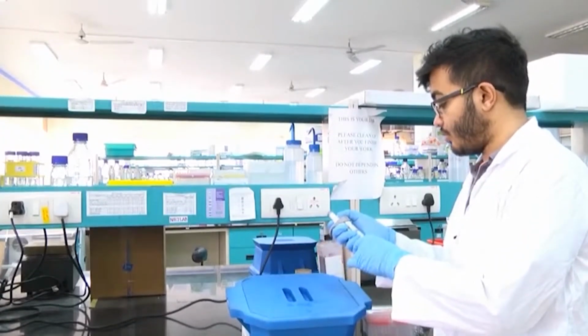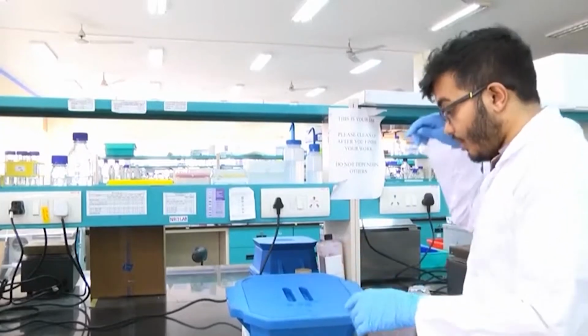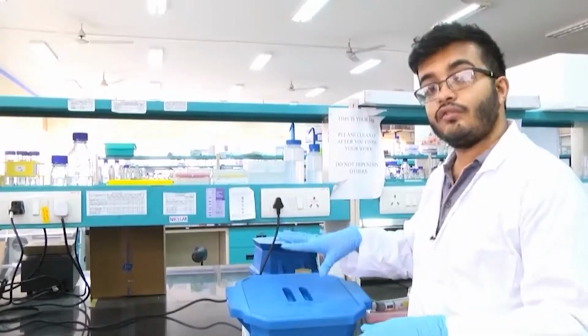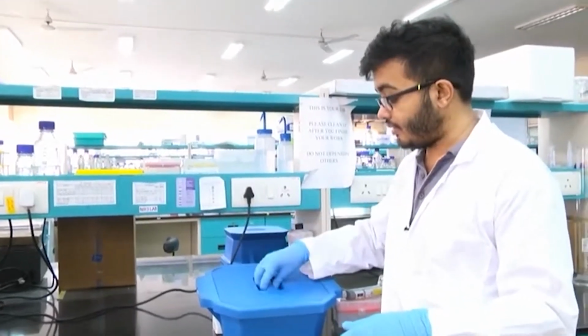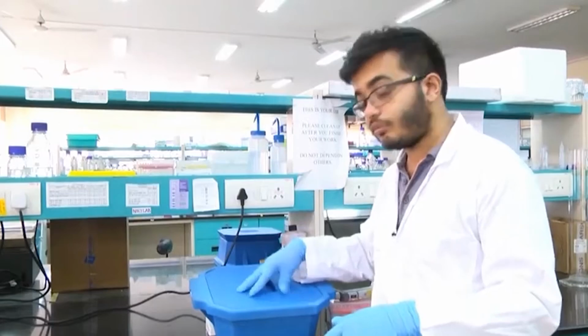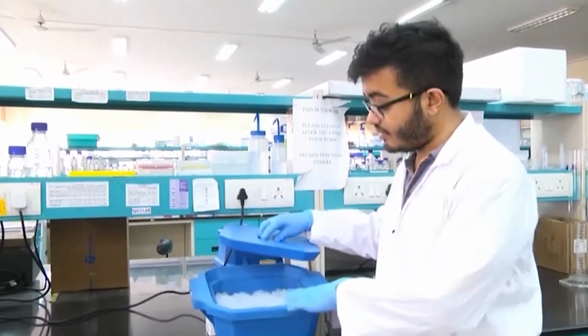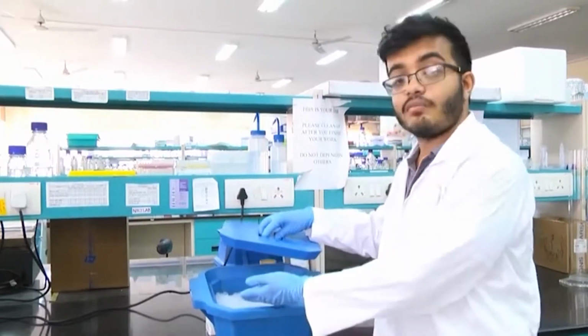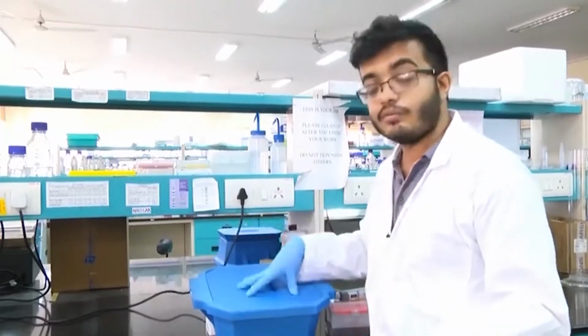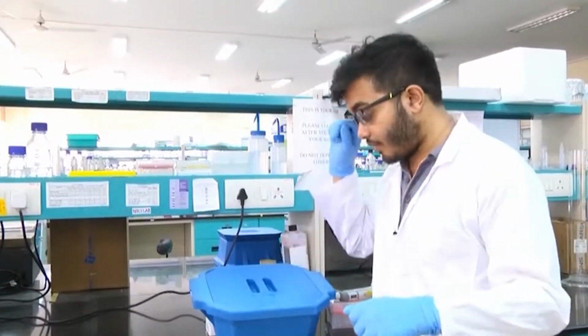Let me just release the pipette. Another point is you have to keep an eye on the ice. Since ours is a tropical country, it gets very hot during summers. If I just leave it like this, after 1 hour, all I will see is that maybe the ice has melted and the tubes are floating around. That is bad, that will defeat the entire purpose of the experiment.